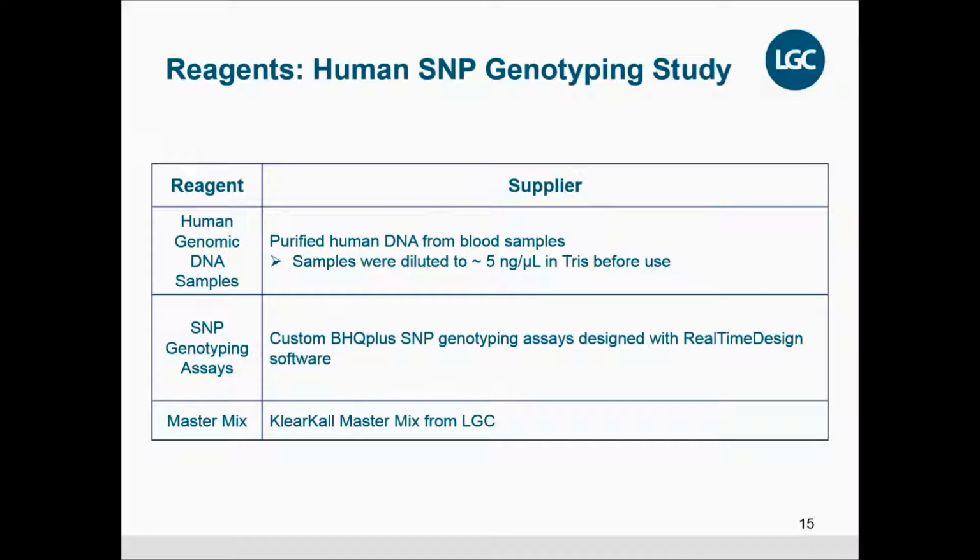So over the next several slides, I'm going to highlight data that we've generated in various research areas and show you the multiplexing capabilities of the chemistry and instrument combination.